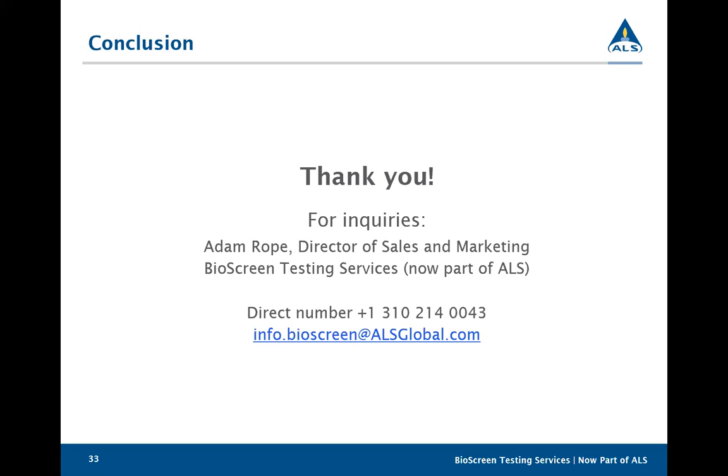Great. We have a question from Susan. Is it recommended to perform stability testing on actives on all mineral sunscreen? I would recommend performing stability testing, period. And bear with me because stability is a little bit outside of my testing expertise. It's a different department here. I'm unsure if it's actually required, but it's an important part of testing your product.